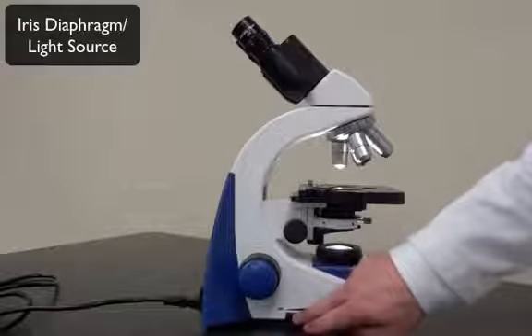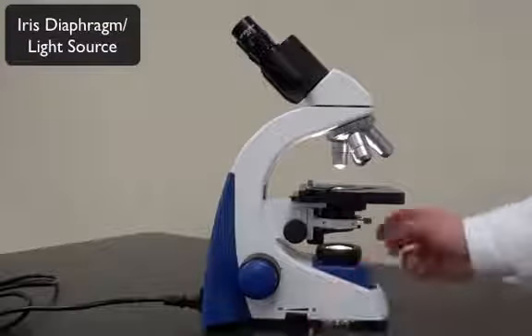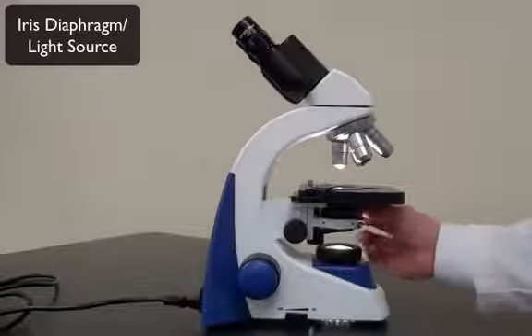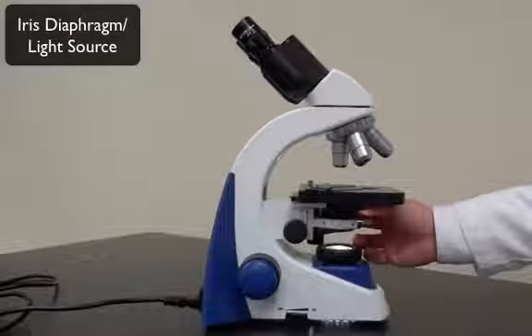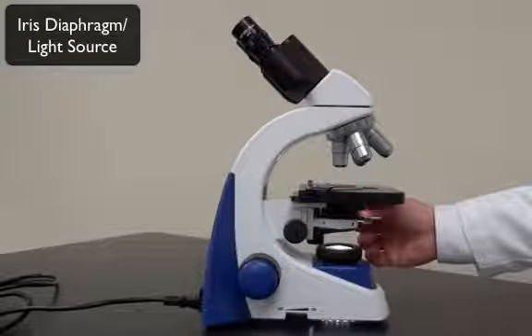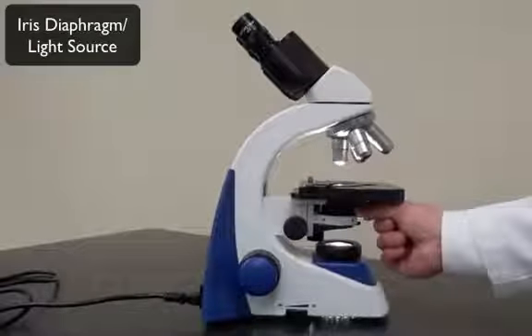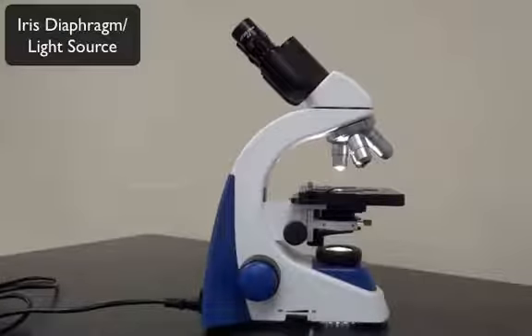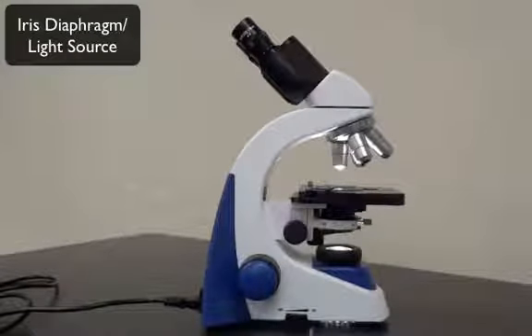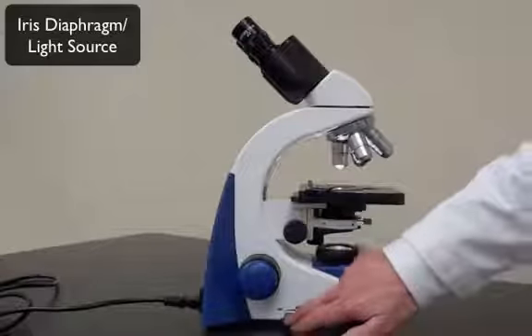So we can adjust the intensity of light here, along with the iris. And maybe if you can see here, where's that iris? Okay, so I don't know if you can see that light change, but I closed the iris, so there's very little light getting up into the microscope or the slide area. I'm opening up the iris and you can see how the light just opens up there. So it's kind of like a filter or a blind of sorts there. I'm going to turn off our light source here.